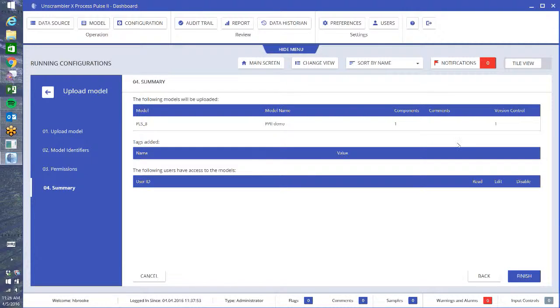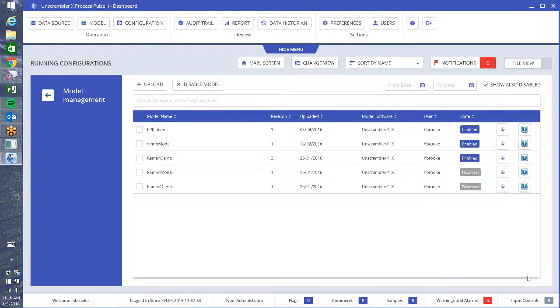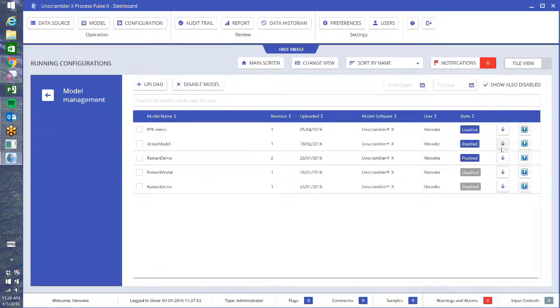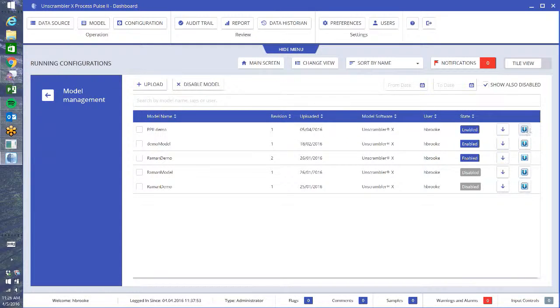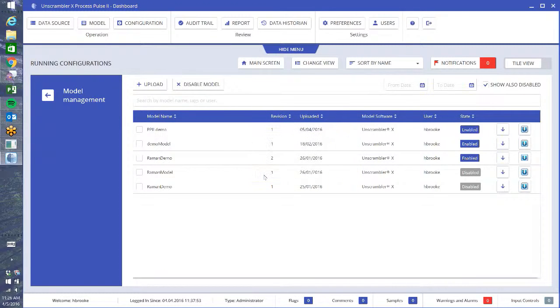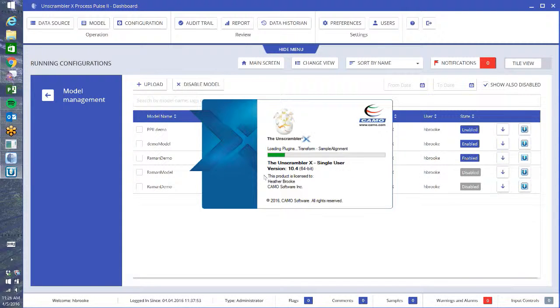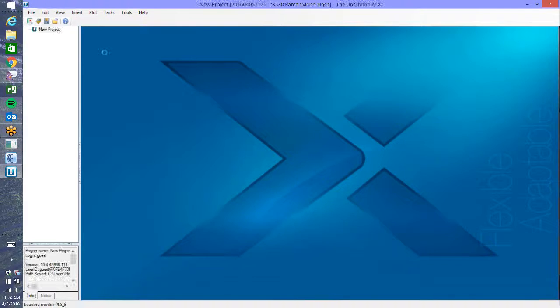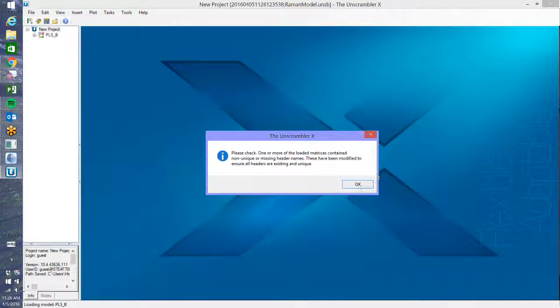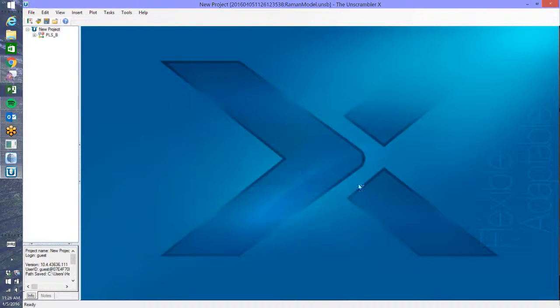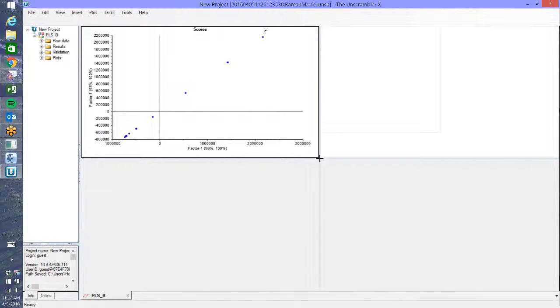And this is just an overview summary to make sure that you have all the settings the way that you want them, and we go finish. Now once you have a model in here, you can always download that model using one of these buttons, or I could open it directly in Unscrambler if the Unscrambler is available on the computer that you have Process Pulse installed on. If I push this button, it pops open Unscrambler with this particular model, and you can go and check what your settings are here.